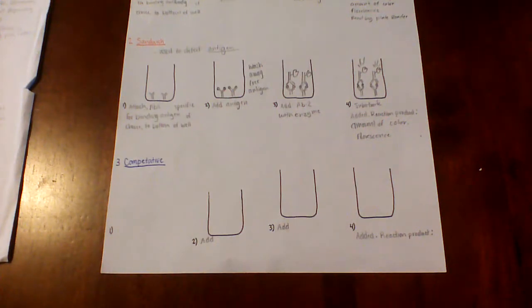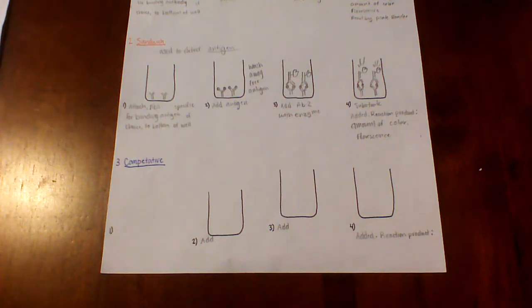Alright, so the third and last ELISA method is the competitive assay. The competitive assay is a more sensitive version of the sandwich because it can detect very sensitive amounts of antigens.